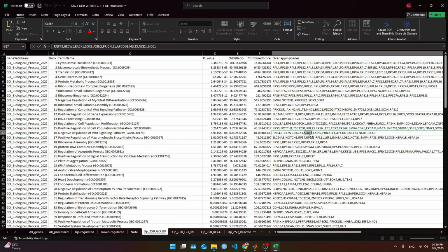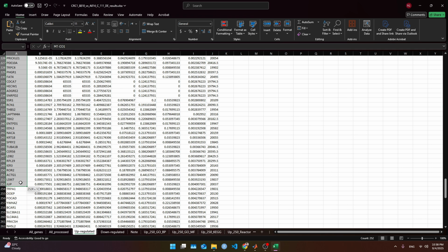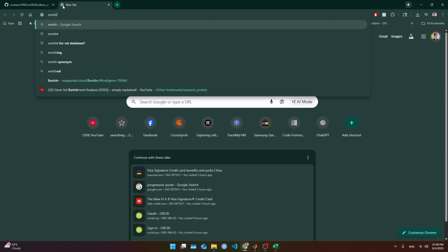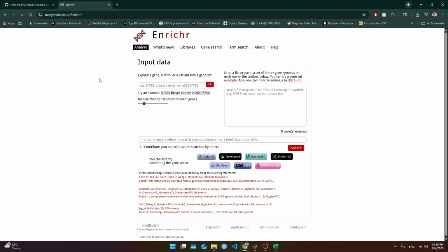So what we're gonna do in this case is go to the upregulated and grab the top 250, copy it, and jump directly to the Enrichr website. Enrichr, it's gonna be the first one. We hit the net.